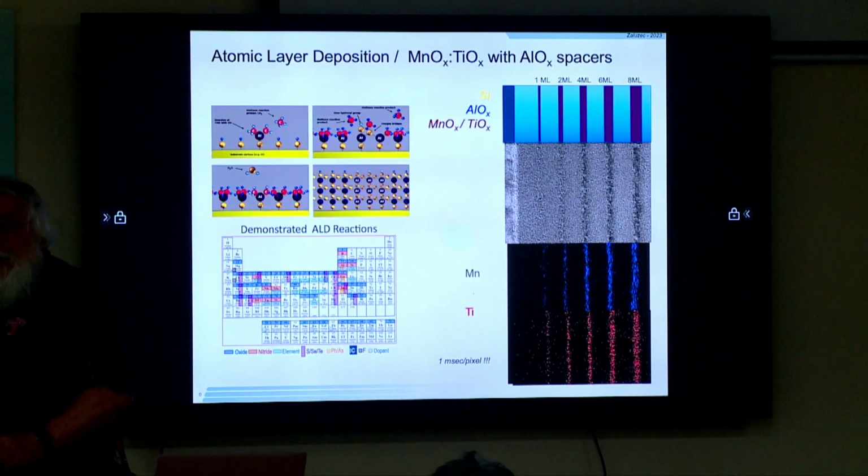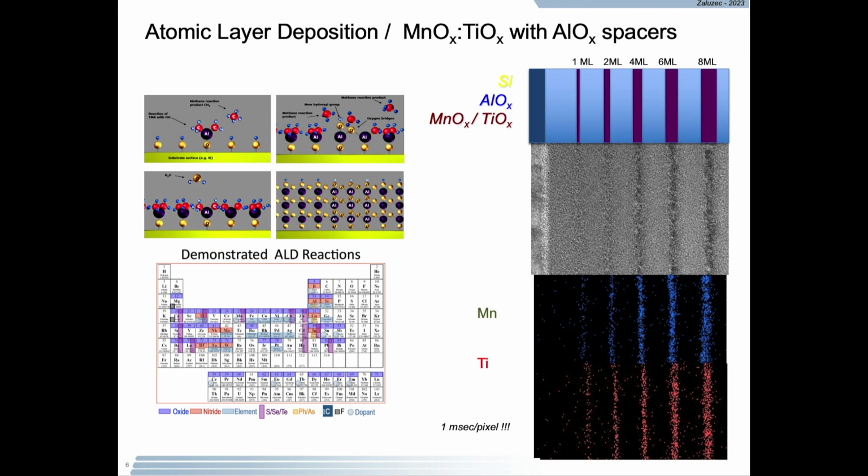There's another example of that. An engineered material. How many of you have heard of something called atomic layer deposition?